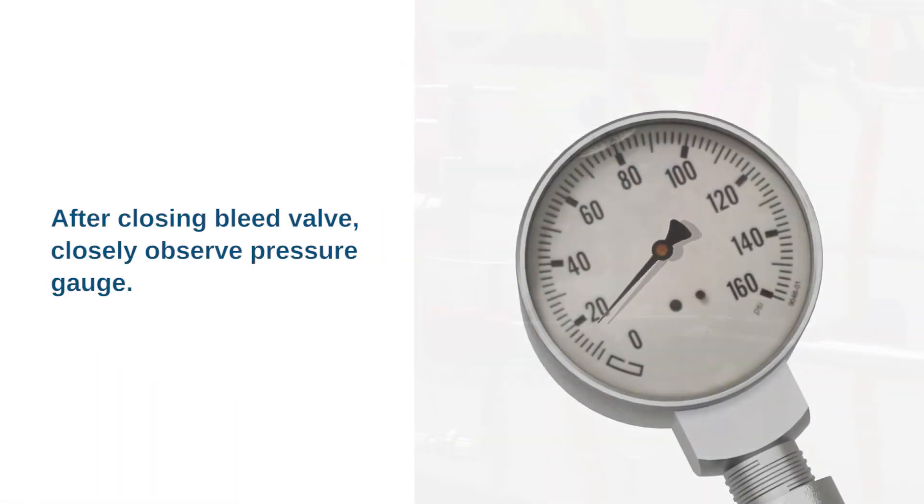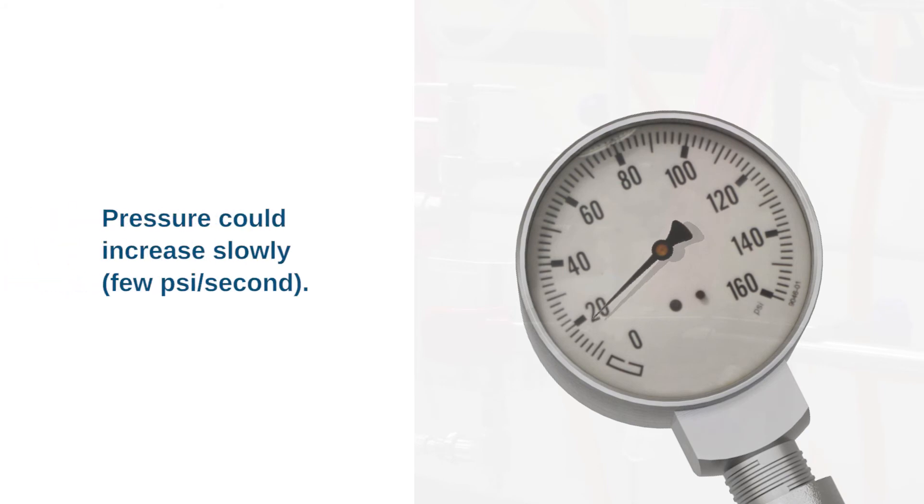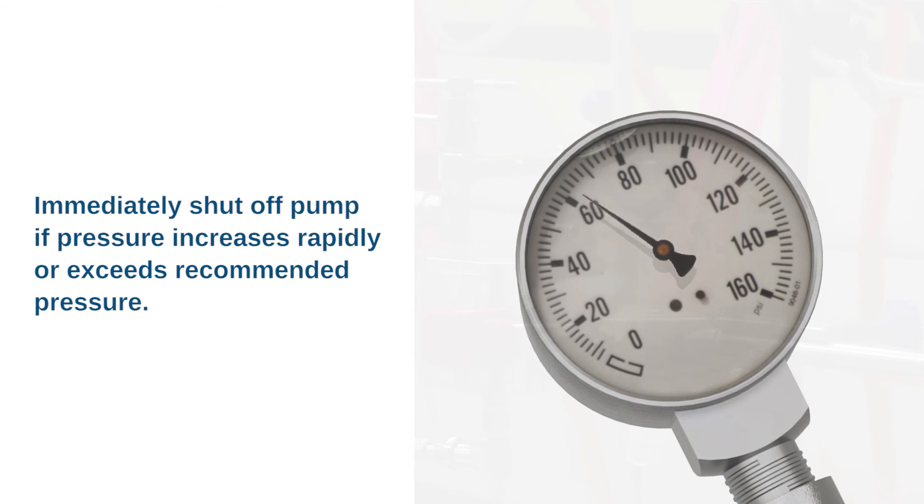After closing bleed valve, closely observe pressure gauge. Pressure could increase slowly. Immediately shut off pump if pressure increases rapidly or exceeds recommended pressure.